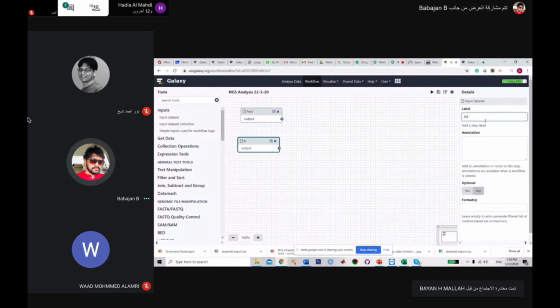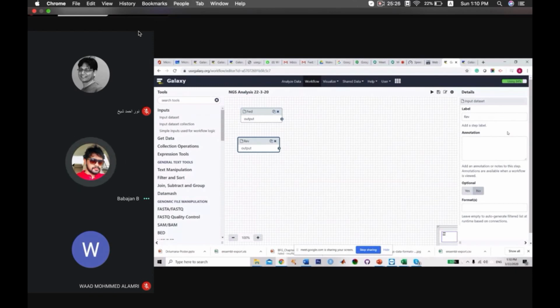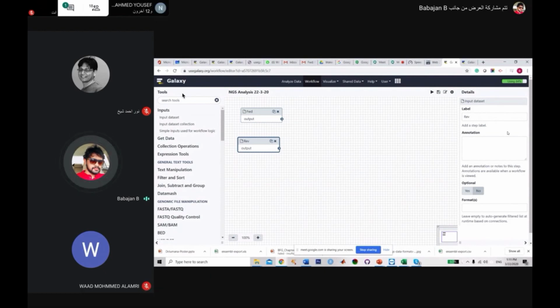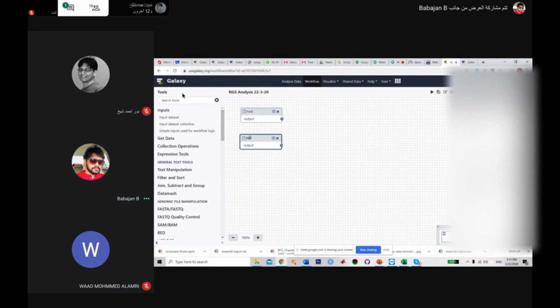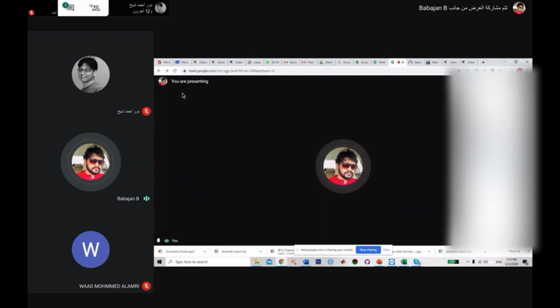Here, the reverse one. So the forward and reverse one. Now we have an input. As I told you, Illumina generally does paired-end analysis. It means from one sample you get two different types of files, one for the forward strand and another for the reverse strand. For each and every sample you get two files, forward and reverse. So what is the next step once we receive the sample and have done the FastQ? Haifa, what is the next step?